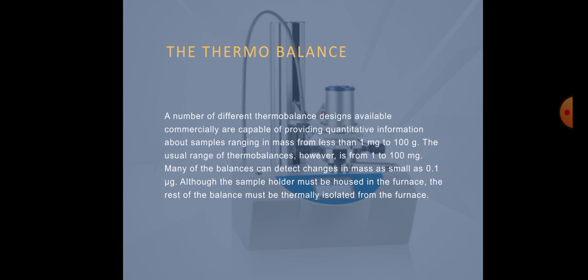in mass from less than 1 milligram to 100 gram. The usual range of thermobalances, however, is from 1 to 100 milligram. Many of the balances can detect changes in mass as small as 0.1 microgram.